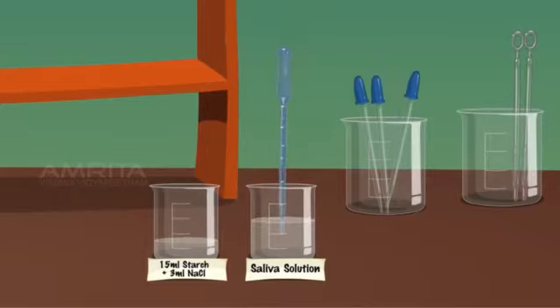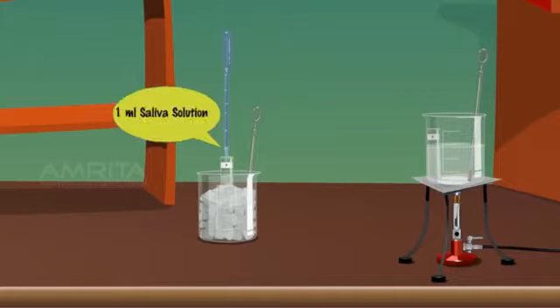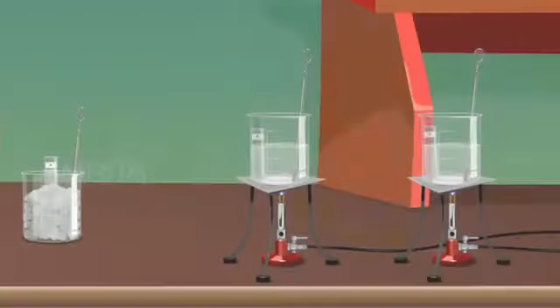Using a dropper, take 1 ml saliva solution and transfer the solution into test tube A. Similarly, add 1 ml saliva solution into test tube B and test tube C.